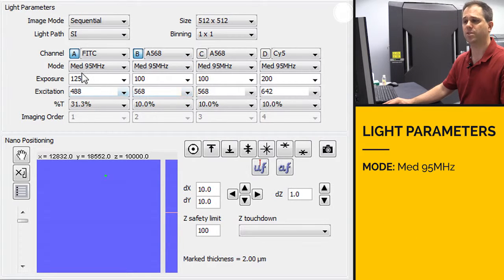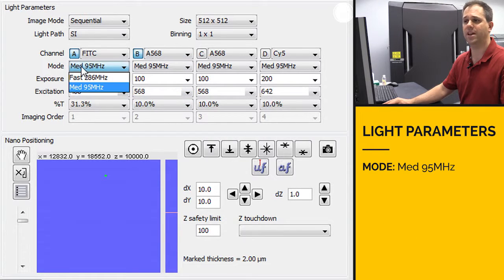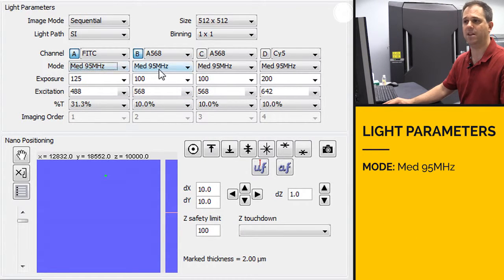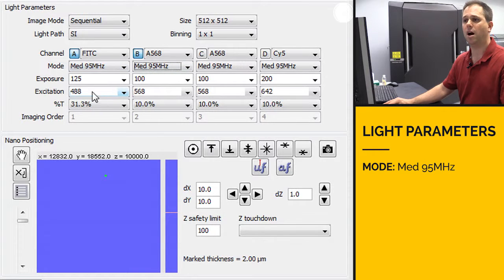In terms of the mode, you can just leave that at medium 95 megahertz. It really doesn't matter which one you choose.